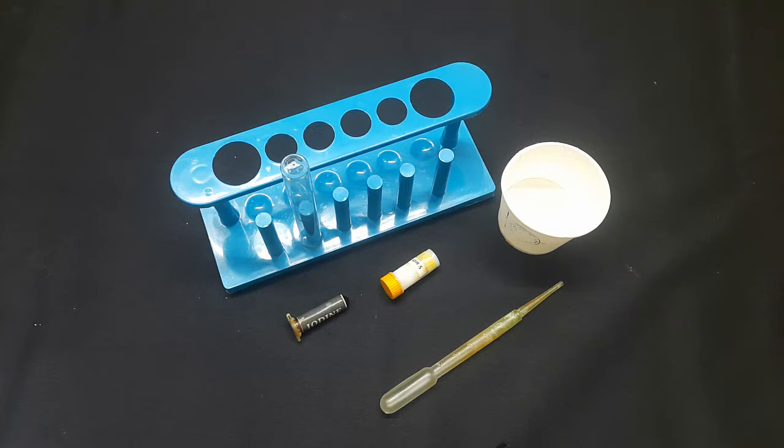Whenever we are talking about starch, starch can be defined as the most important complex carbohydrate compound. This is also called the iodine test. The iodine test for starch is mainly performed to test the presence of a carbohydrate. So let's start this activity.